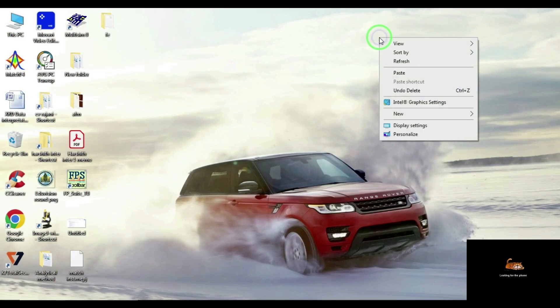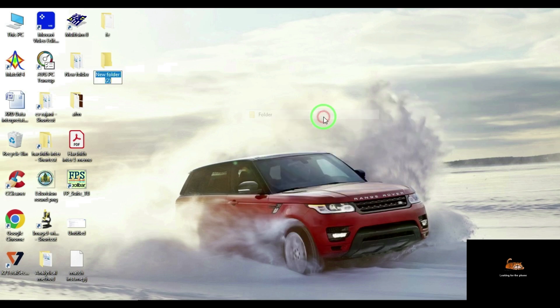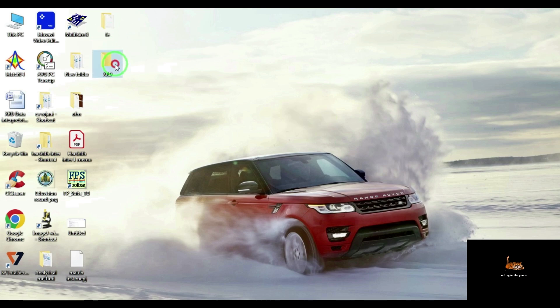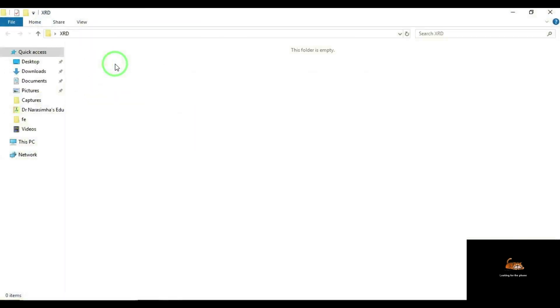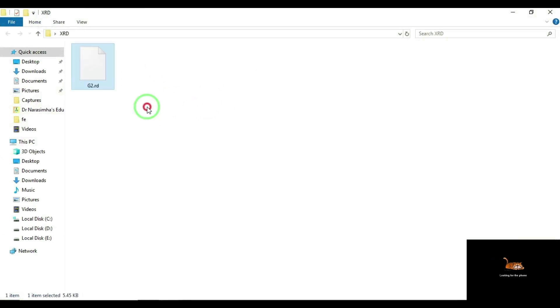First, create a folder on the desktop. Here I am going to create a folder labeling it as XRD. Then save the XRD data file in this particular folder. This is nothing but my XRD data file.